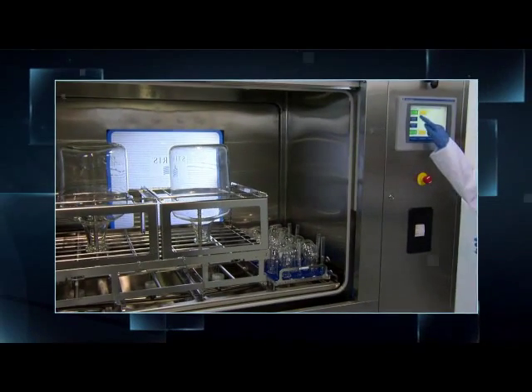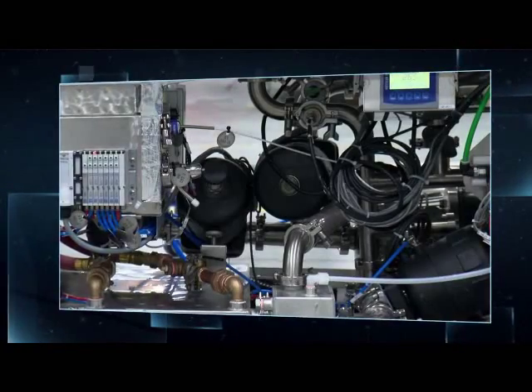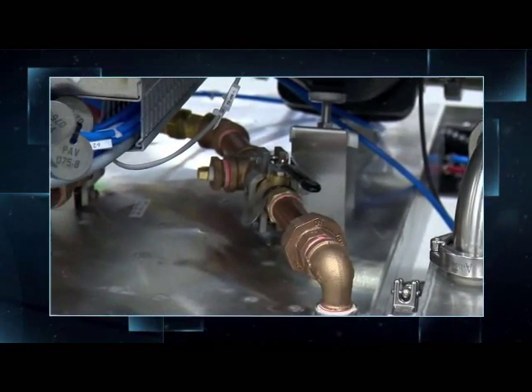A unique non-circulated or single-pass rinsing system significantly reduces consumption of purified water. The 480PG washer can also use recirculated, chilled water to cool down the effluent during each heated cycle phase.